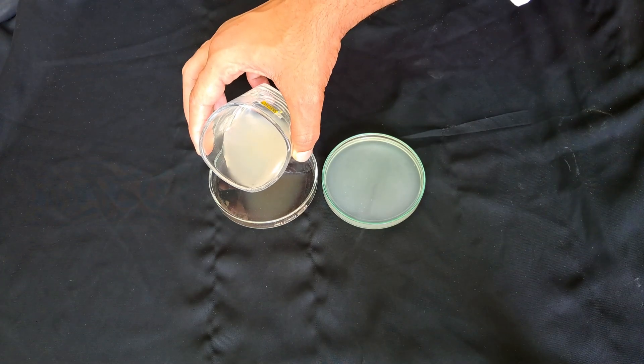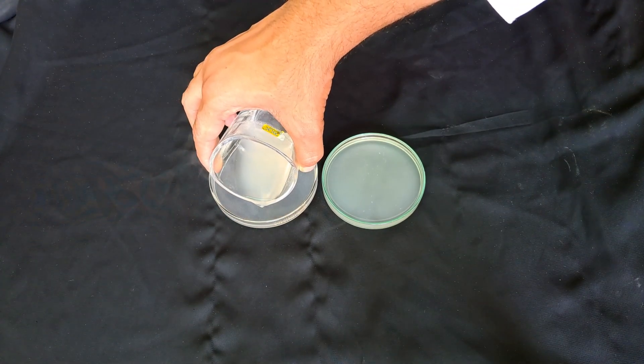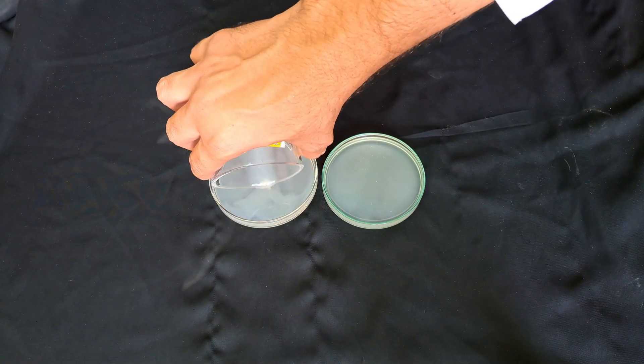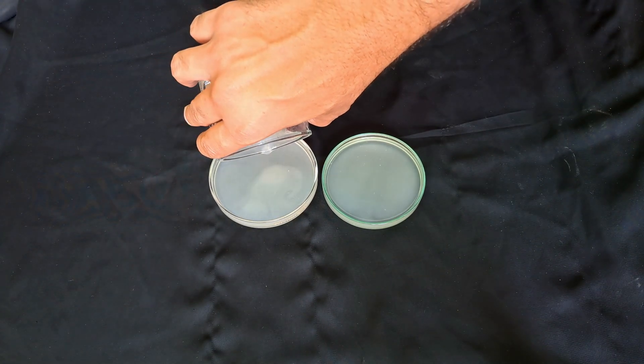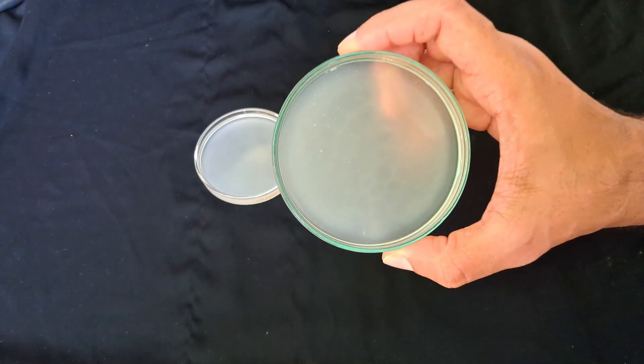The dishes should be partially filled. After a few minutes, it solidified.